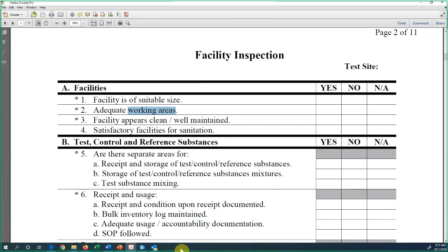That's good. If you can say this fume hood is only for standards, another one is only for extraction, another bench is only for analysis in the same room, that's also good. As long as you specify the place, don't mix them because you may get contamination.